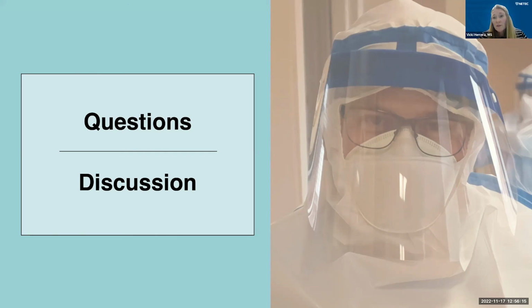So I think you have to look at every step again in your system. Normally, we would recommend not using open tube systems, but again, there may be some ways that you could mitigate. Whether that's removing the testing personnel from the area, minimizing that, or wearing appropriate PPE. Do you have PAPR on hand? Do you have N95s? Do you have mucous membranes all covered? So there may be some ways to mitigate that, but you really do need to think through every single step.